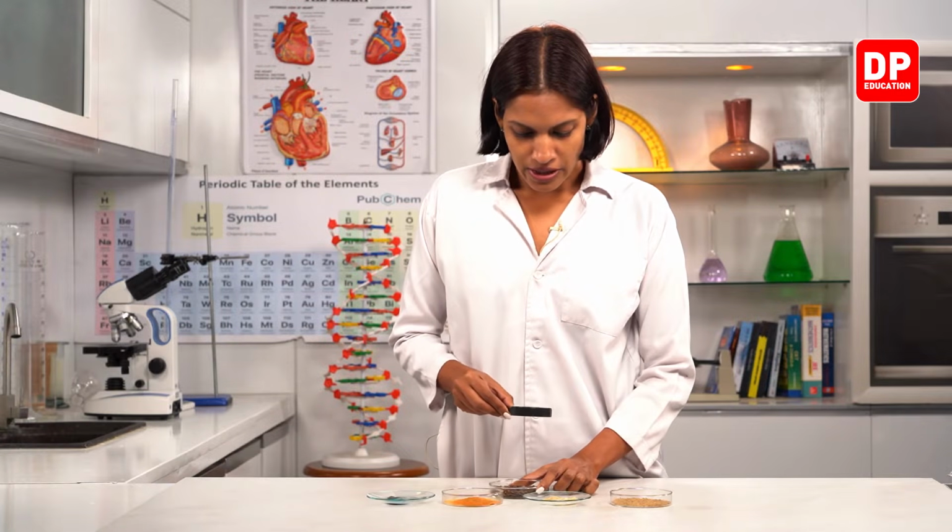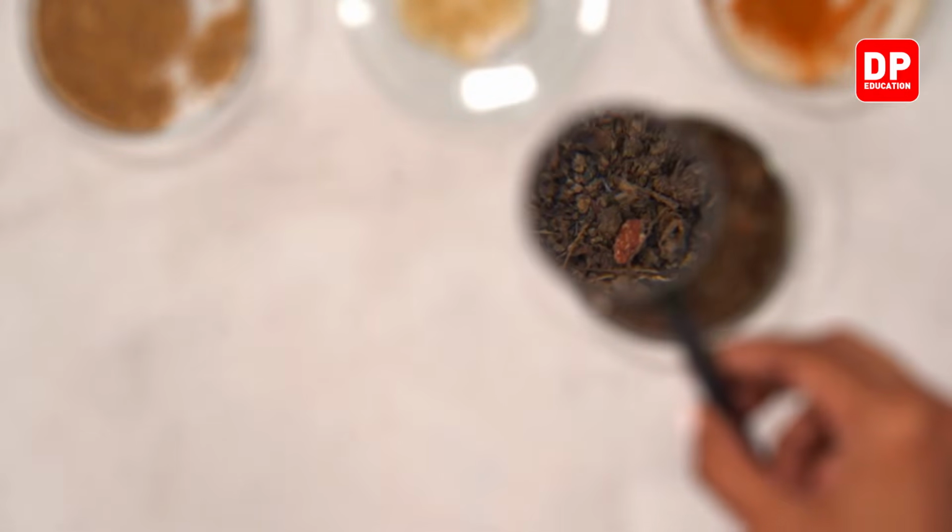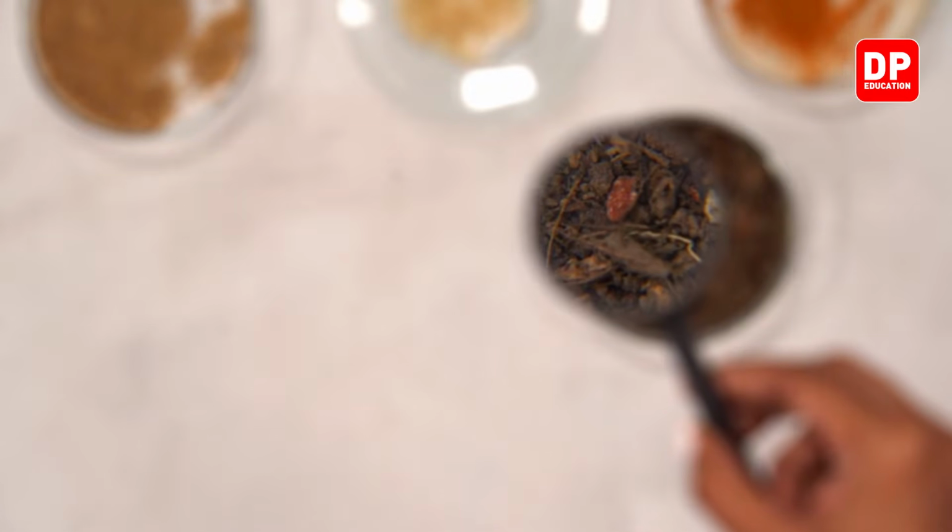Now when I observe this soil sample, I can see sand is there, right? Different colored particles also present, children. Can you all see this one? There are small stones present, and there's an insect also moving through this soil. And you all can see dried leaves present here, and parts of plant roots, parts of plants.